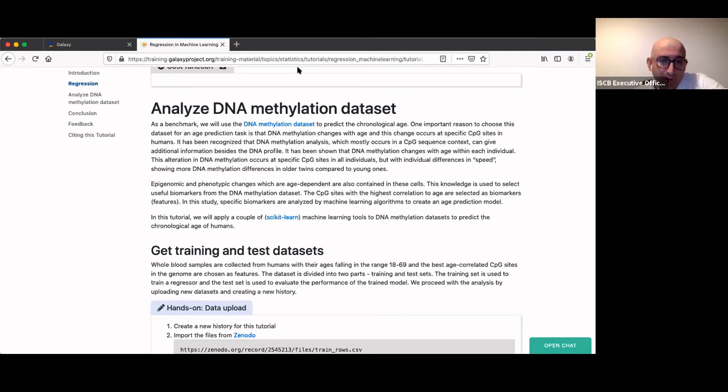Okay, so at the first step, we should upload the data to your history, to your platform. The data that we are using in this training material is clean data, so you don't need to do noise filtering or handle missing values.